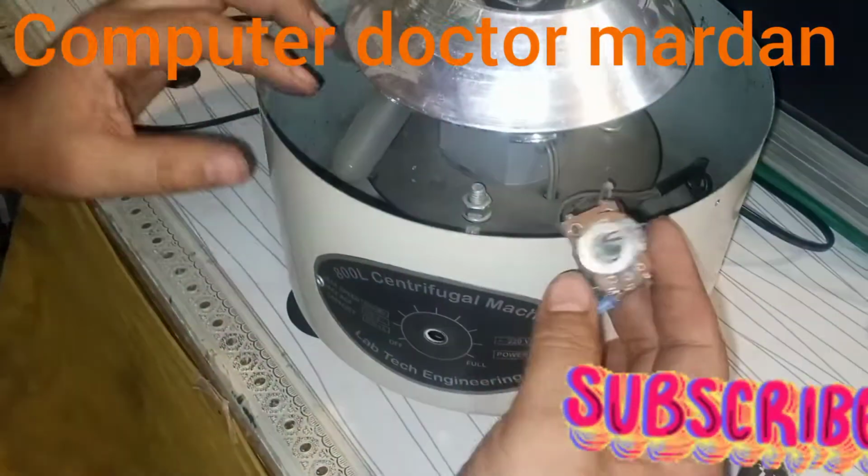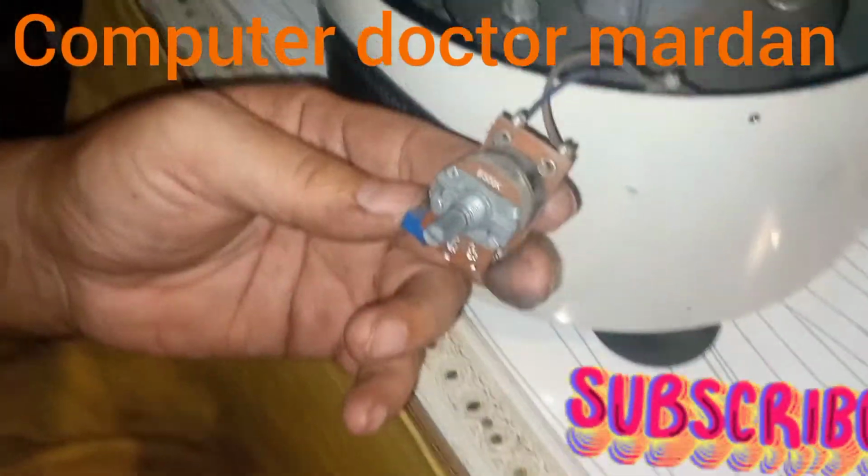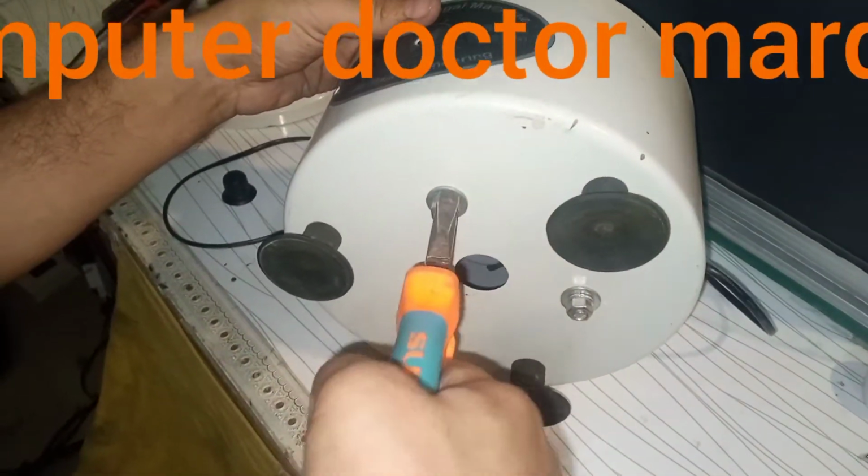So that's, you see, it's the regulator. Oh, this screw I will open.